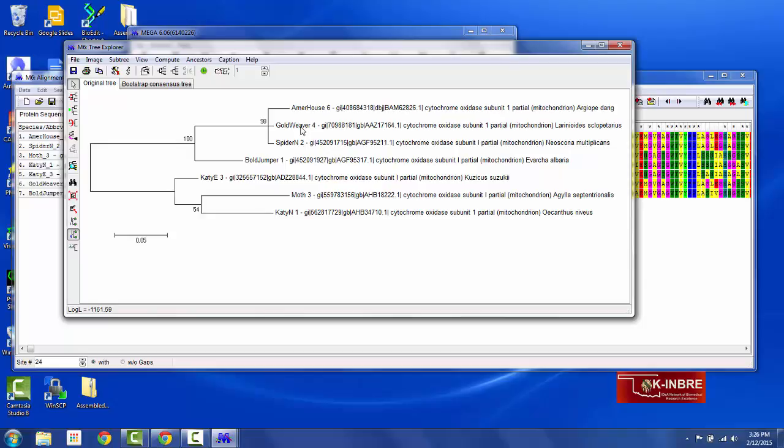A tree is typically depicted with only bifurcating nodes, and not this trifurcation or multifurcation. What's happening here? This can be interpreted to mean that of all the trees that were analyzed, this tree with this trifurcating node was the most likely tree, or had the best likelihood score. So it looks like there's one node and it splits into three. However, we can modify this display.